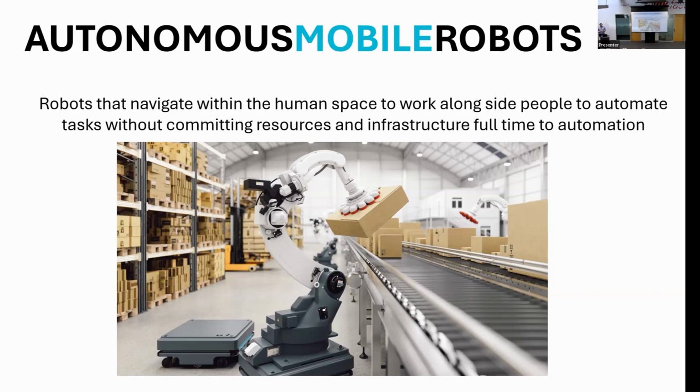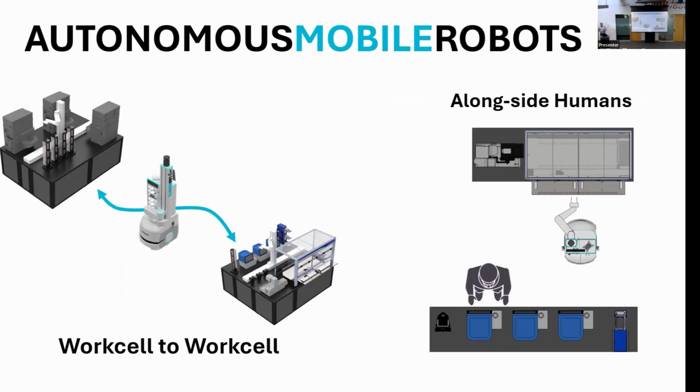And then moving into the lab automation space, they can be utilized beyond just sample transport, primarily in two main ways. They can be used to move samples between different work cells. In contrast to the previous description that Imad had put together, utilizing track-based systems, these are much more flexible as they can simply drive around in an environment without major overhaul of infrastructure.